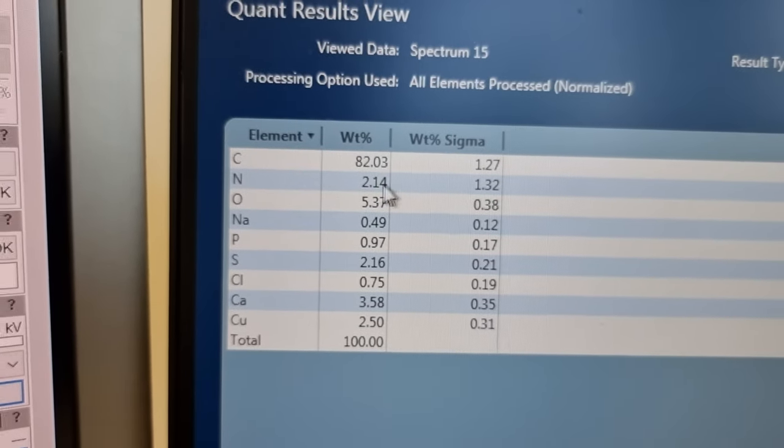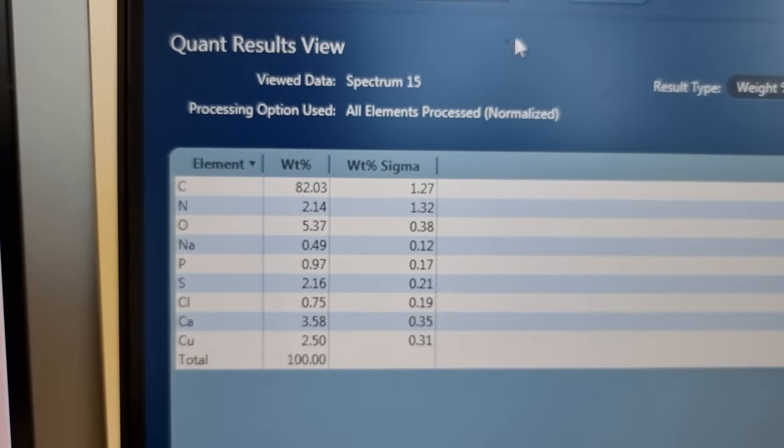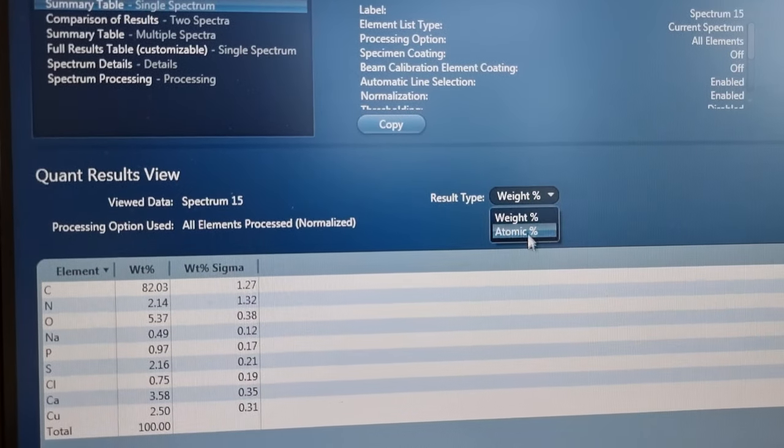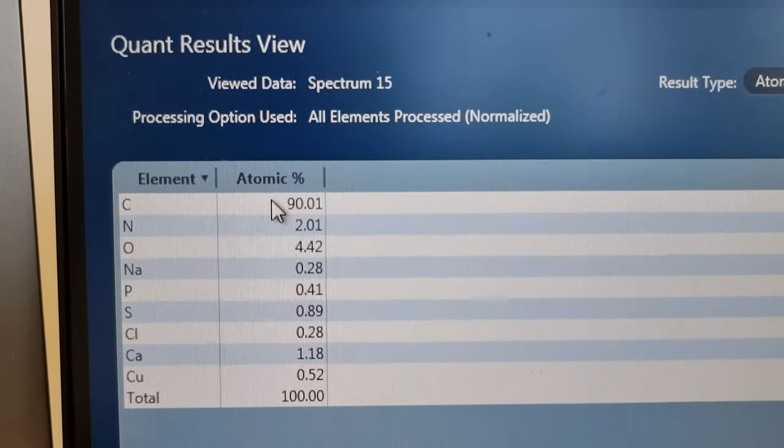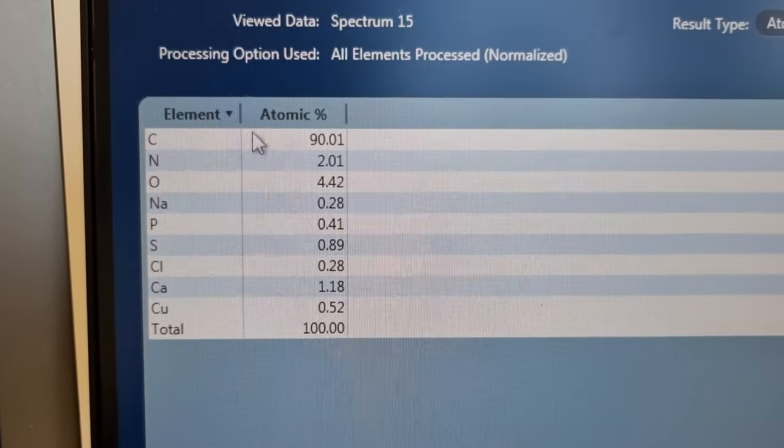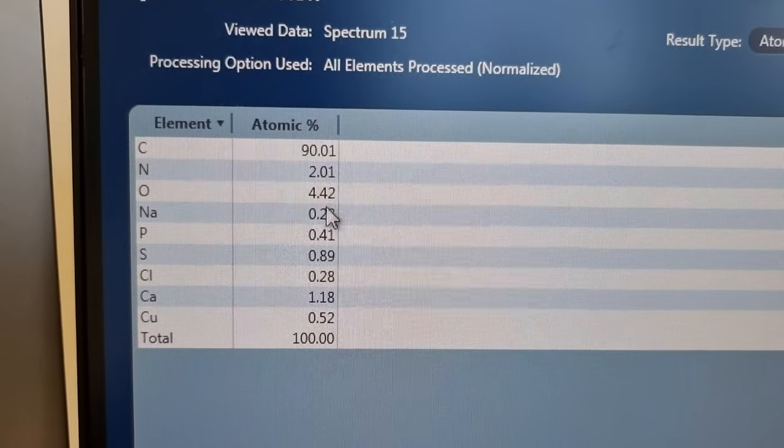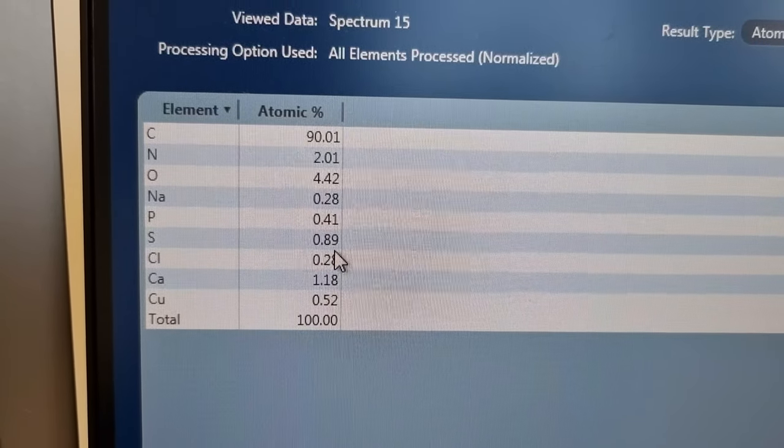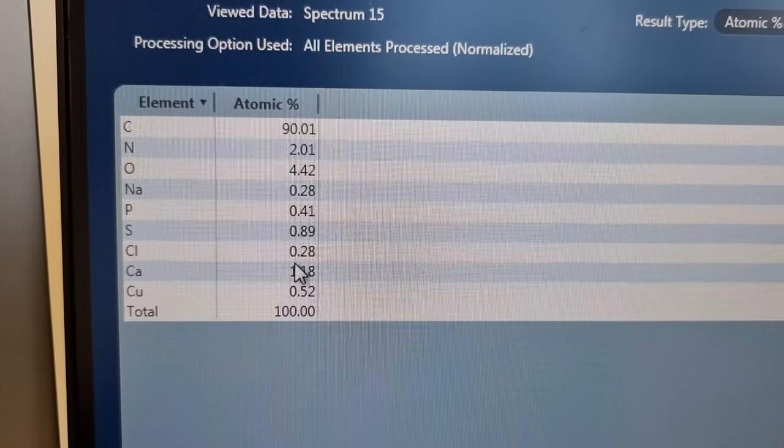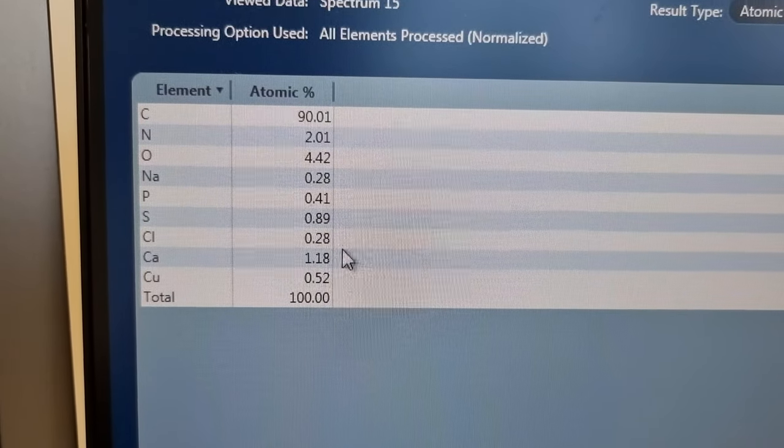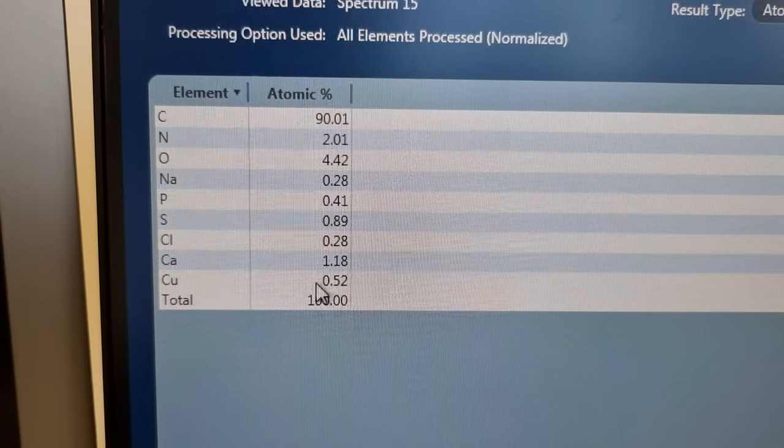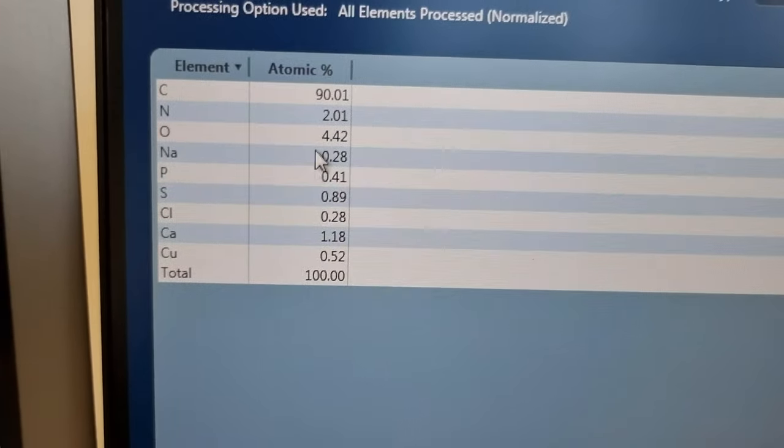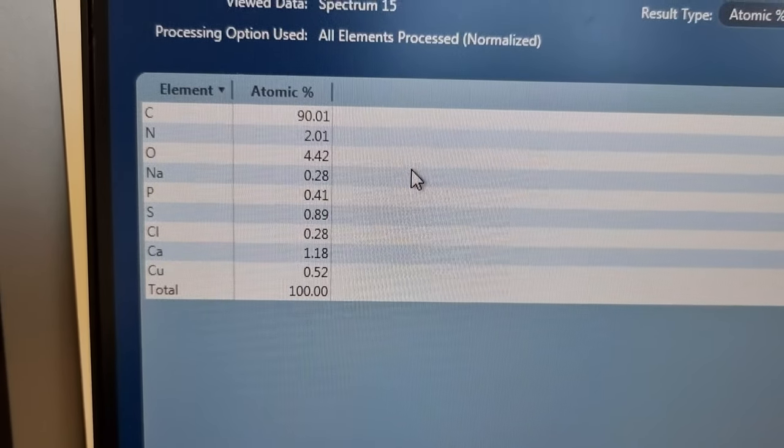And if you look at this, it's 82% carbon, and we're on weight percent, so if I go to atomic percent, it's 90% carbon. So Matsumoto, well done, you are right. But we've also got sodium, phosphorus, sulfur, chlorine, and calcium again. And almost, this is below the detection threshold here, 0.52, there's almost no copper in this at all.